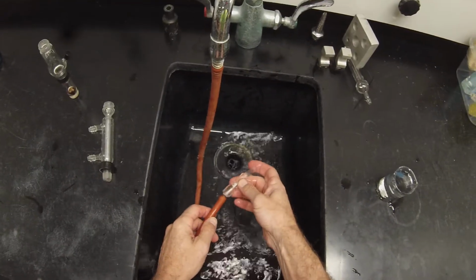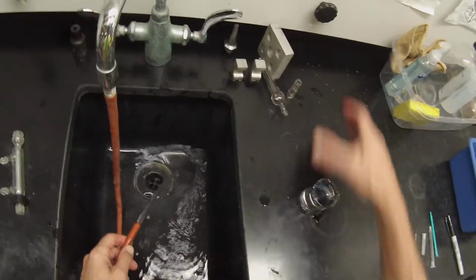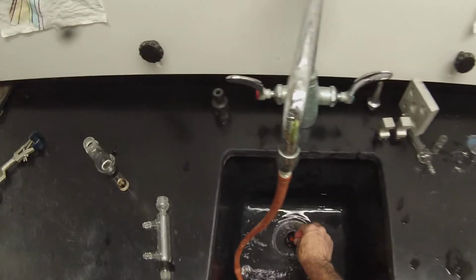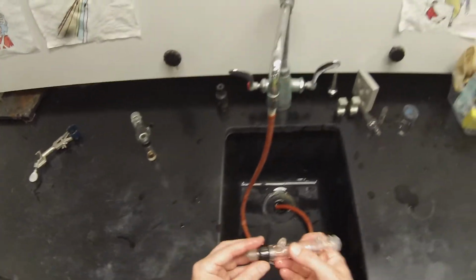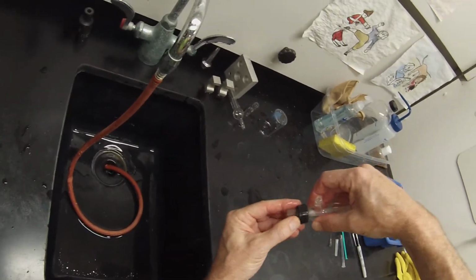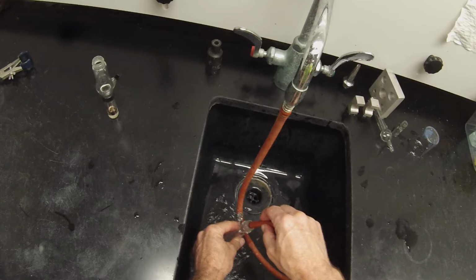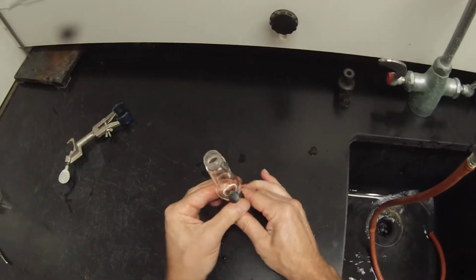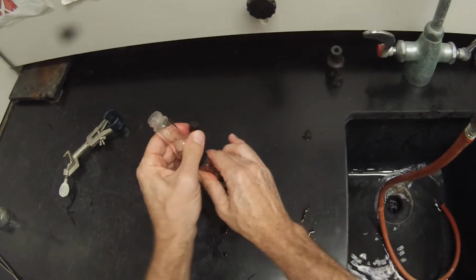Same with the thermometer adapter and the beaker. Just let that run for a little bit while I disconnect these. Sometimes it's a little difficult to get that O-ring down where you can grab it with your fingers. Especially on the Hickman still, that's going to be hard because it's so short. So to get that O-ring off, it's just barely touchable at this point. Looks like it's going to have to cool a little bit more before I can get that apart. Let's clamp back.